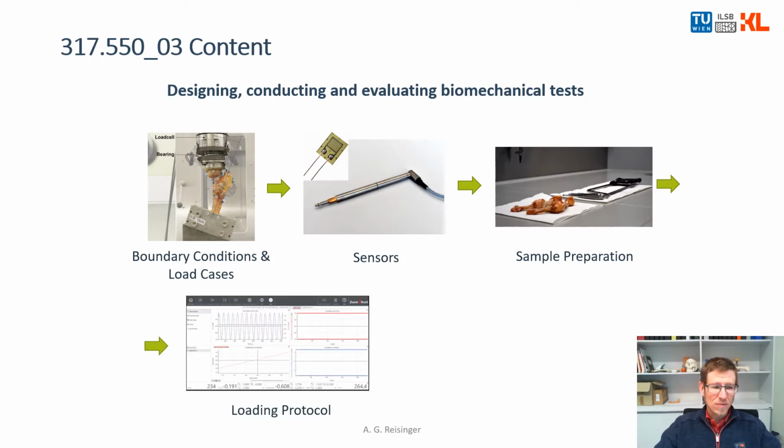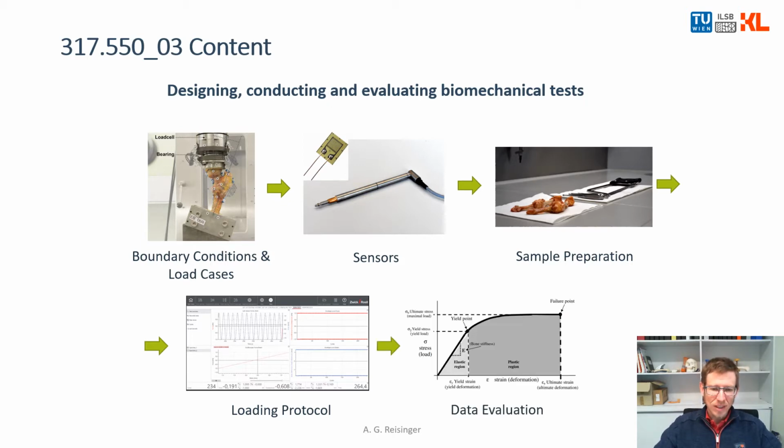Imagine you have your sample mounted in your testing machine, you have all the sensors mounted, the sample is prepared, then you have to apply the loading protocol. So what displacement, what force you apply on your sample. And you gather data, and after your experiment, you have to do the data evaluation to extract the properties you want to know of your sample.